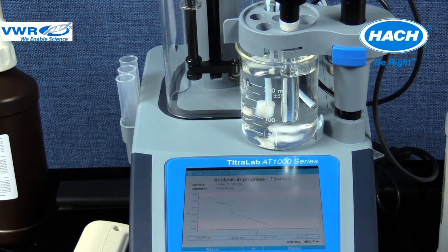As the free iodine concentration becomes less, the solution becomes less conductive, and the measured current drops. The endpoint is determined when there is no change in current, signaling that all the total chlorine has been reacted to oxidize the PAO. Eventually, you will see a flat line occur on the graph. The point where it becomes flat is the equivalence point or endpoint and is used by the software to calculate the concentration of chlorine in the sample.